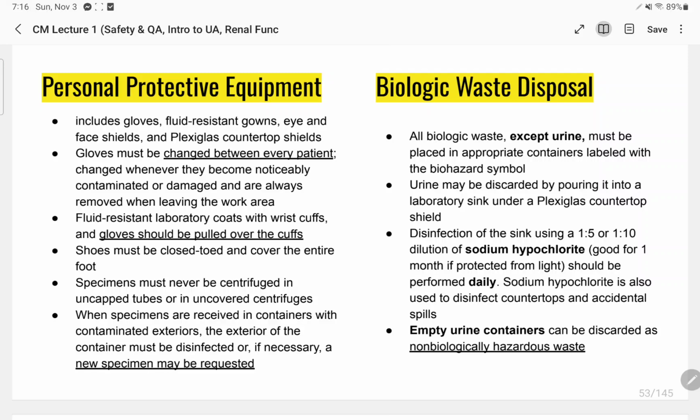This is not allowed. What is important is that we cultivate our skills so that wherever we are placed, even if standards require full PPE for COVID, you can still perform your job without compromising your safety and the safety of the patient, okay?